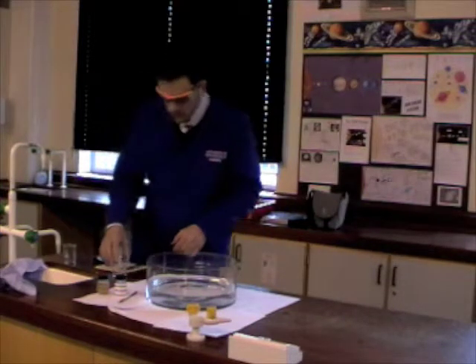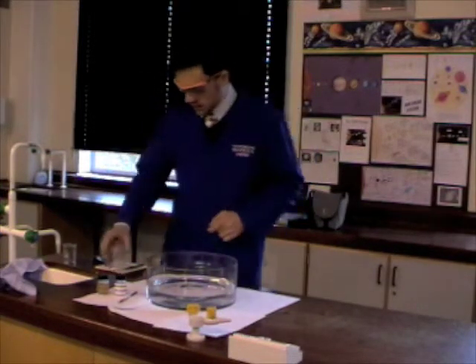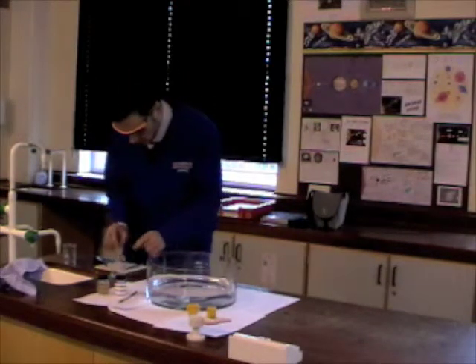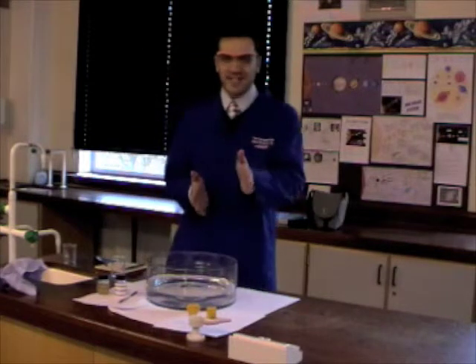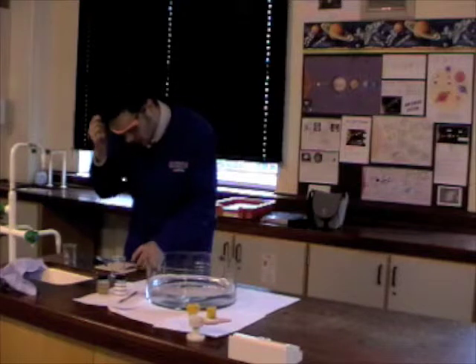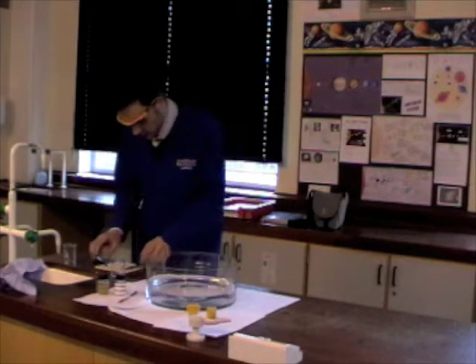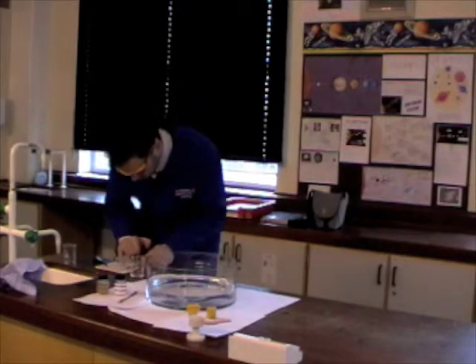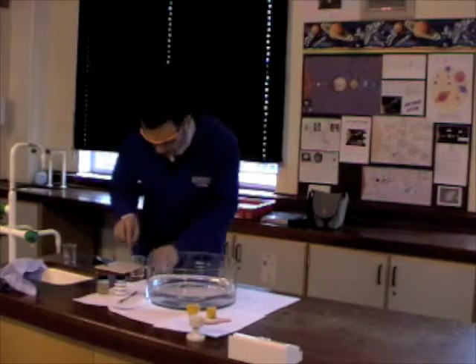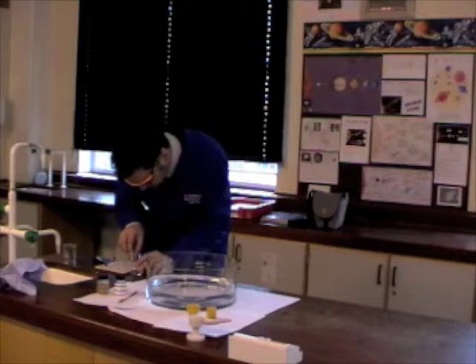Right, I've got in here a little bit of hexanes. That's because potassium, the metal, has to be stored underneath a mineral oil to keep it from reacting with water in the air. That's just how reactive it is. I've taken out a tiny little bit from my bottle and I've got it on the tile here, you might be able to see it, it's really small, the bit that I've got. I'm going to wash the mineral oil that this is kept in off using the hexanes.